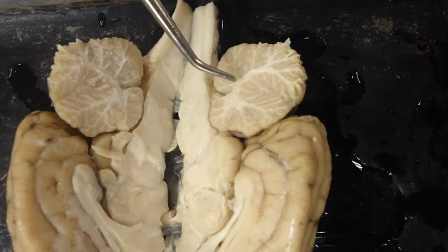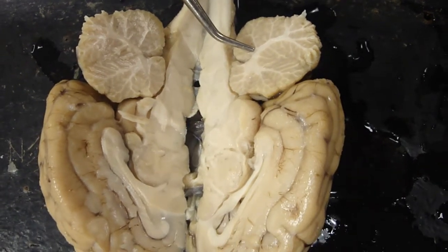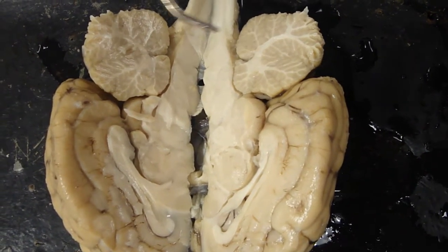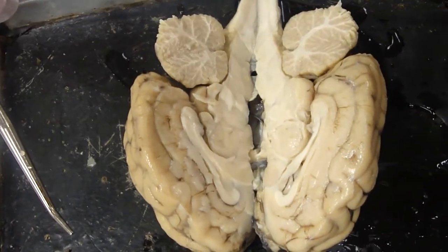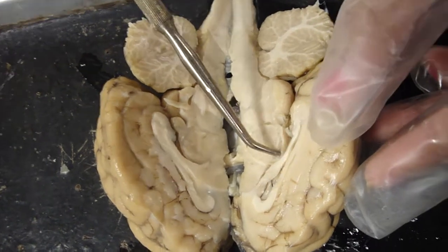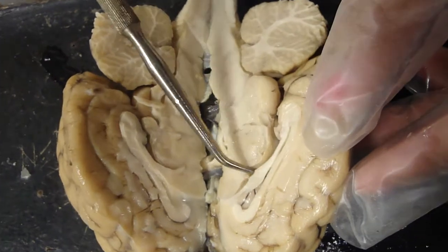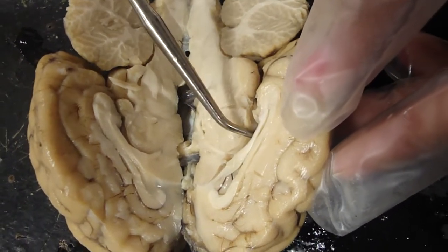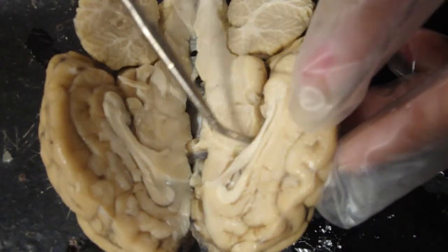If we look more up into the regions of the cerebrum here, I'm actually going to switch halves on us. This one might show better what I want to look at. There are cavities in the cerebrum, in the brain. One of the cavities would be right here in this half. As I open up this opening, this is called the lateral ventricle. There are two lateral ventricles, so there's one in this hemisphere of the cerebrum. There's also one in the other hemisphere.